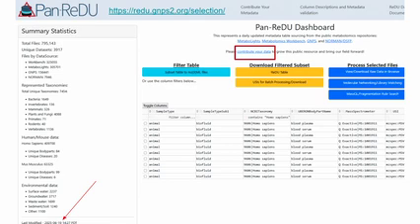So people uploaded their raw data that they have measured, and now we can reuse them and look with a bird's eye view on all this metabolomics analysis that have been done in the past, which are, we have published metabolomics data and placed it in Zenodo and raw files and extracted files.